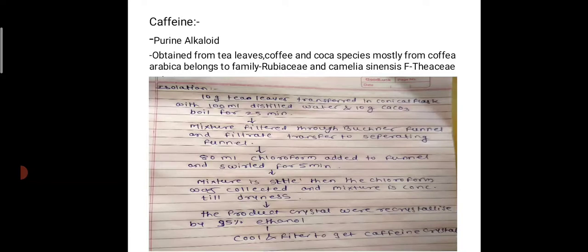After getting the crystals, to get them in purified form, they are again recrystallized with 95% ethanol. Then cool and filter to get caffeine crystals. Okay, this is the process of isolation of caffeine.